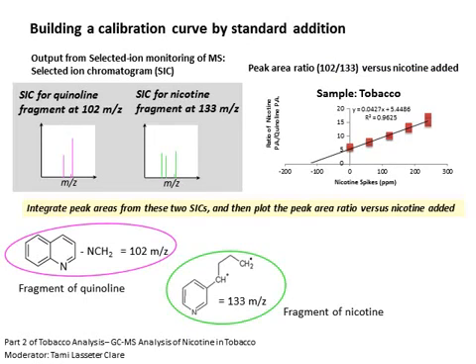Given the complexity of the matrix of these nicotine-containing samples, we will use standard addition to quantify the amount of nicotine present in your unknown. Remember that nicotine is toxic, and so you'll need to take the usual safety precautions. Wear a lab coat, goggles, and gloves, as always in the lab, and you'll use a syringe and work in a fume hood when adding the appropriate spikes of nicotine to your samples.